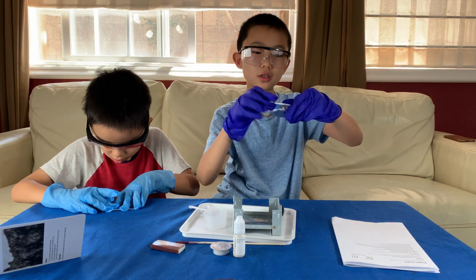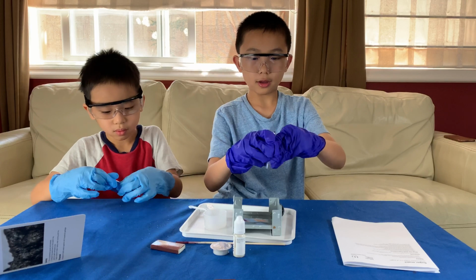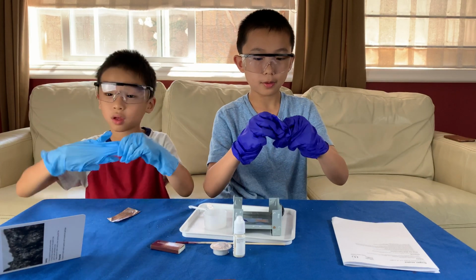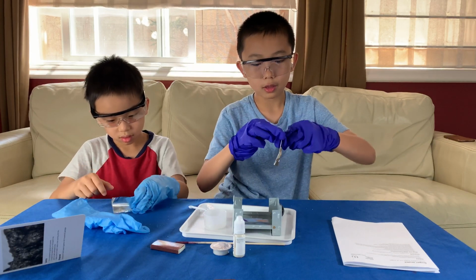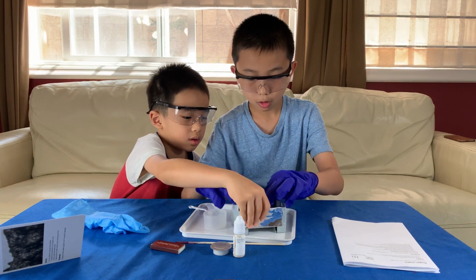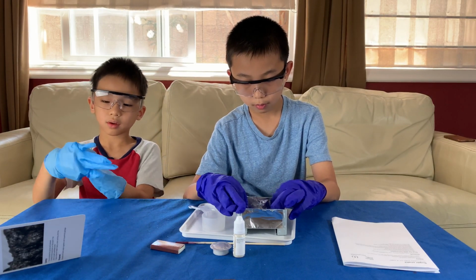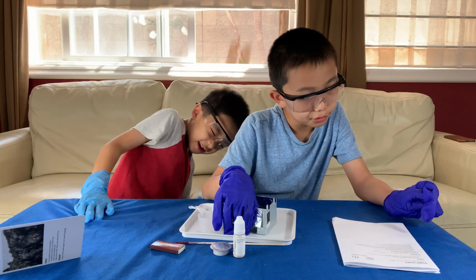Okay, we're folding foil in half. And now I'm gonna open it up. Oh, this is kind of hard to open up with gloves. I'm gonna take, oh, that, here. Okay. And now we've made our stove.